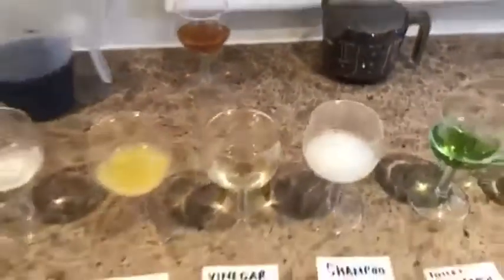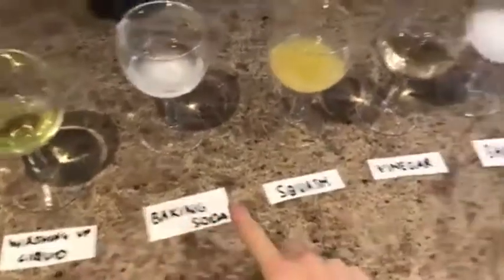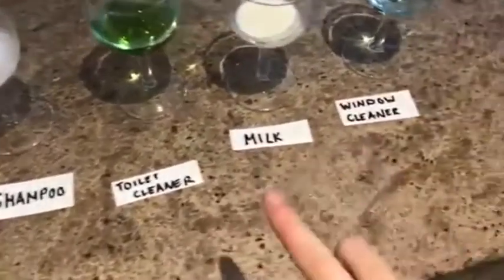I also used baking powder, but that's later on. So these are all of the substances I used: washing up liquid, baking soda, squash, vinegar, shampoo, toilet cleaner, milk, and window cleaner.